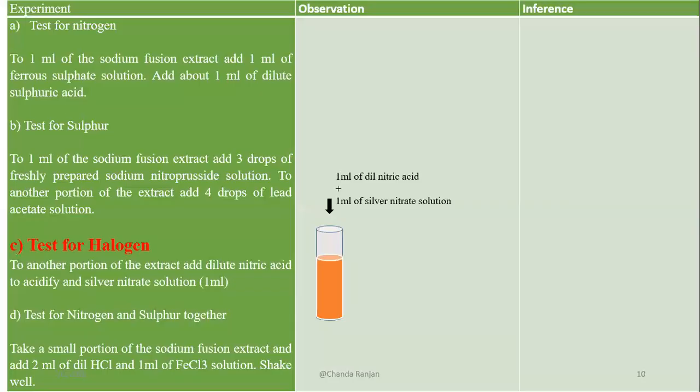Now we test for halogens — chlorine, bromine, iodine. We take dilute nitric acid and 1 ml of silver nitrate and add to the sample, then shake it. No white or yellow precipitate forms, showing the absence of halogens. So nitrogen is absent, sulfur is absent, and halogens are also absent.